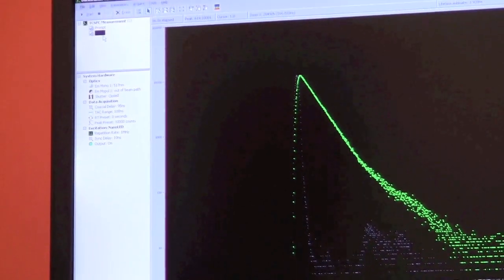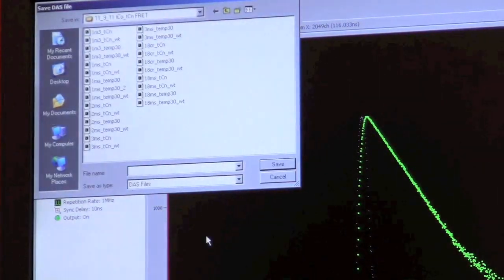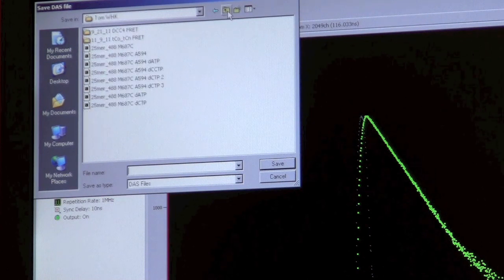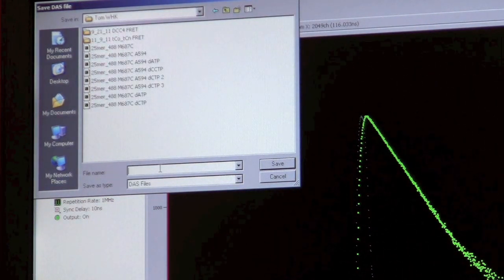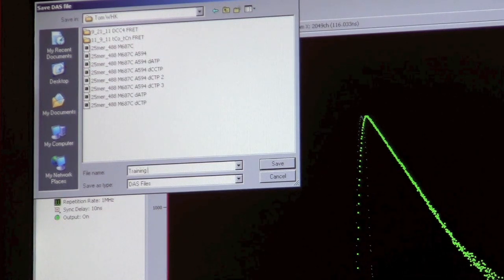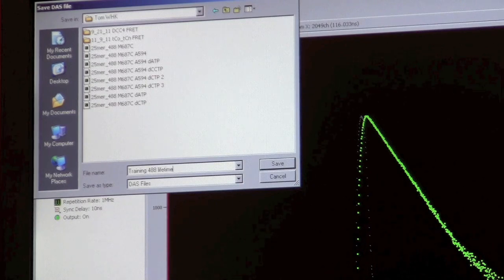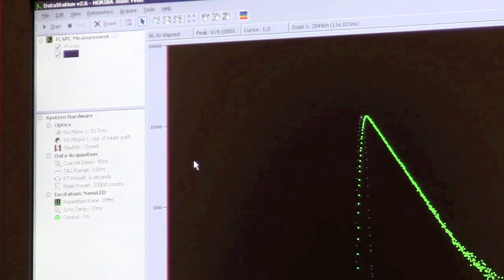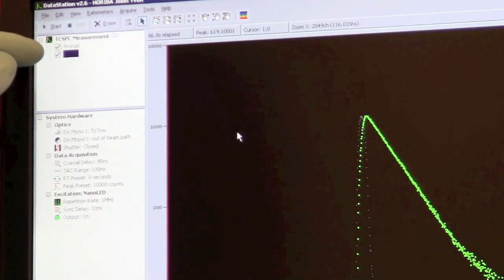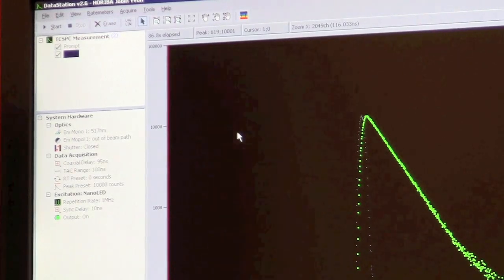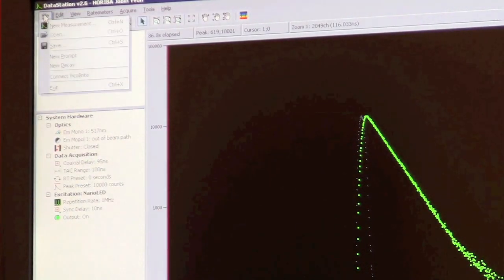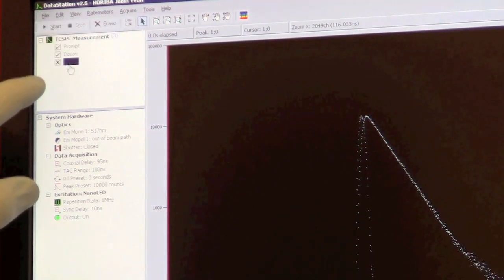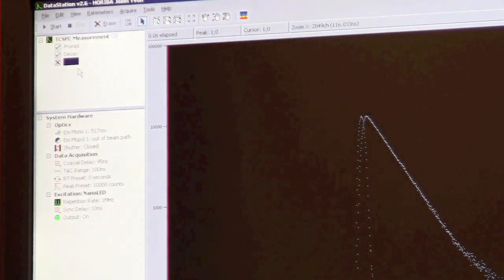Now we want to save our data. We click file, then save. I'll save it in my folder here on the desktop. It automatically saved both the prompt and the decay in that file. If you want more than one experiment using the same prompt, you can do a new decay. But for each decay you save, you'll have to save the prompt again.